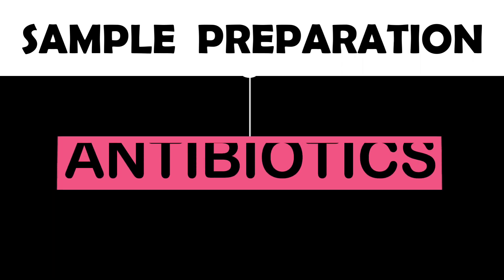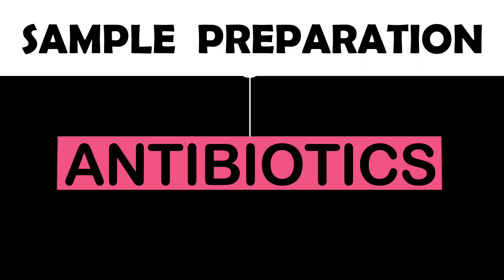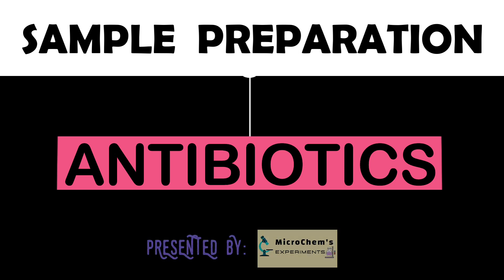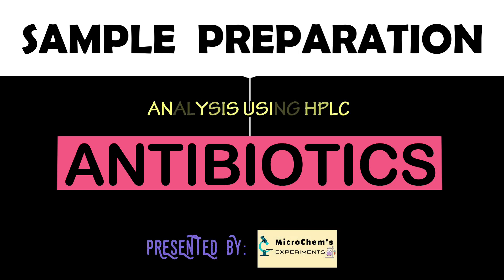Today we are going to prepare a sample for the quantification of antibiotics present in a sample. The prepared sample is further analyzed using high performance liquid chromatography.